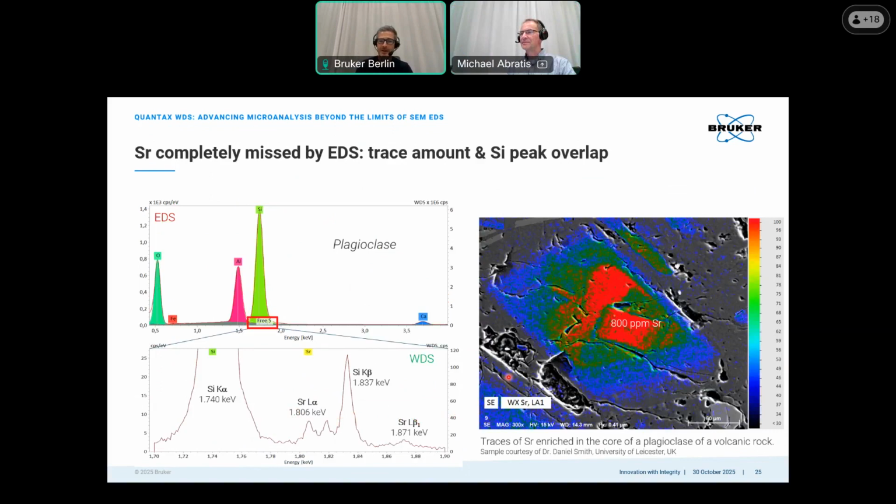Yeah, thanks, Micha. So there's a question perfectly for me. How does WDS EDS compare to microXRF EDS? Yeah, that's a really relevant question, to keep it short and simple. So we're looking for trace. Maybe some of you know that both techniques are highly sensitive for traces.